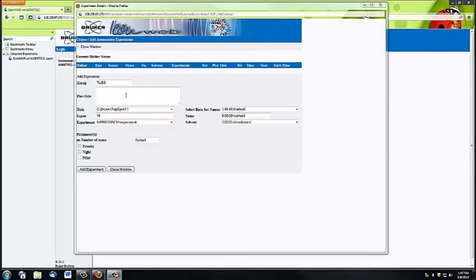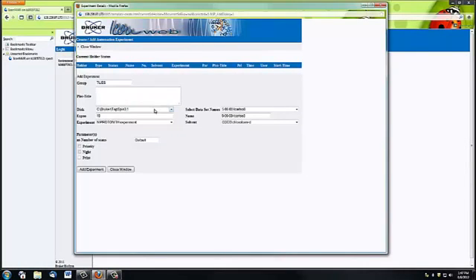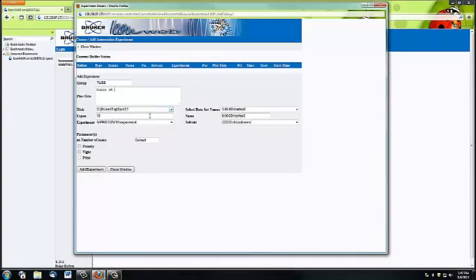Next, you'll need to choose a title for your spectrum. This title will be displayed on the spectrum itself once processing is complete. Here we see the directory and experiment number under which your experiment will be saved. You don't need to change these.